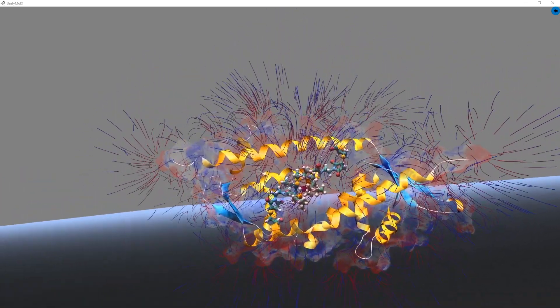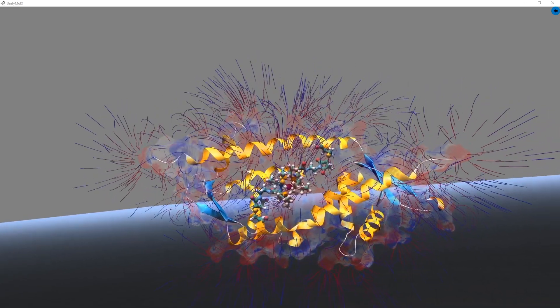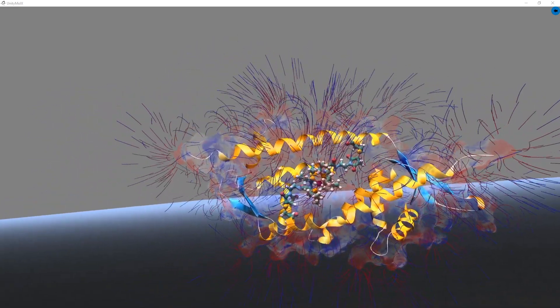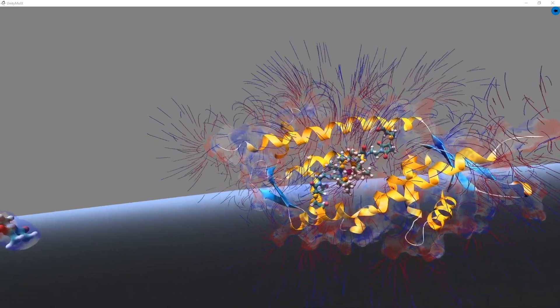The cysteine residues were introduced via site-directed mutagenesis. At the moment, we are showing the surface as a transparent view.